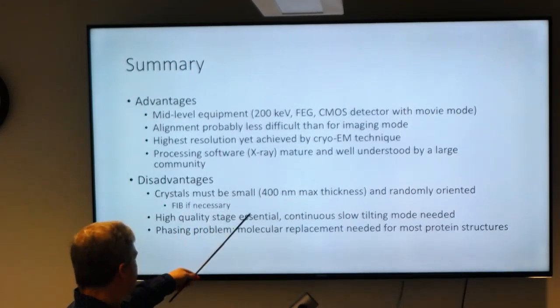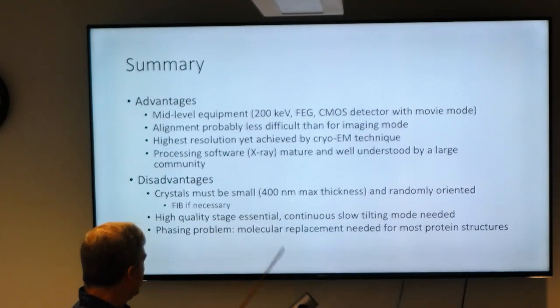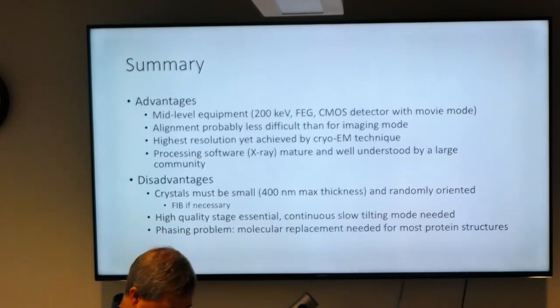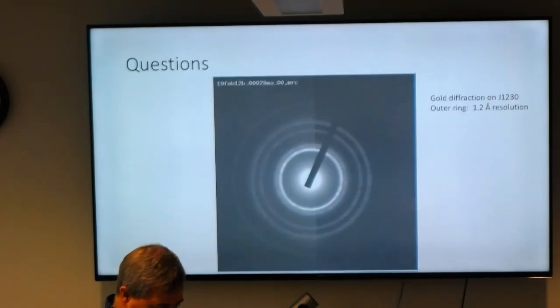The disadvantage is you still have to grow crystals, and the crystals have to be small. And you need a high quality stage where you can continuously rotate it. And you still have the phasing problem. So for most protein structures, you still have to do molecular replacement.